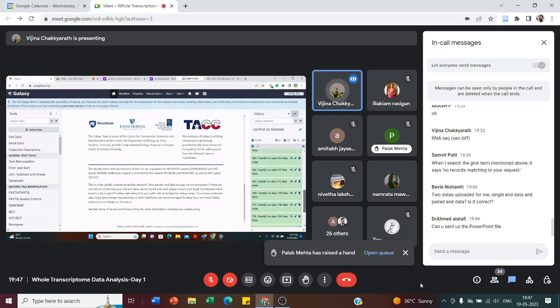It is a parent data set, but it will show like this: 1 and 2.